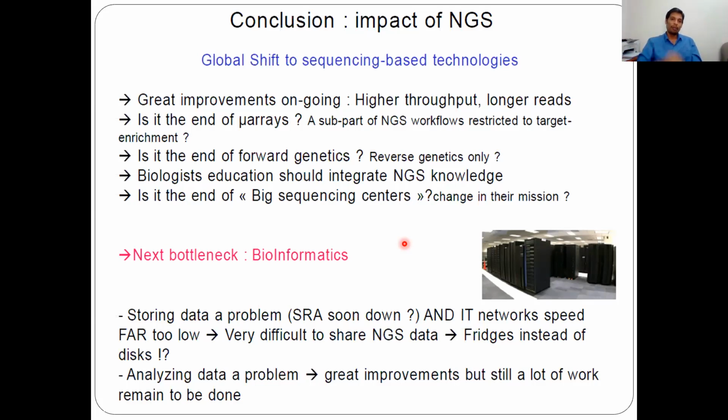There has been huge development in NGS in the last few years, and researchers are taking full advantage of it. In many areas, they first try to understand the unknown information through NGS, or at least get preliminary information, then go for secondary validation methods. Okay, so this is about Illumina sequencing, and thank you everyone.